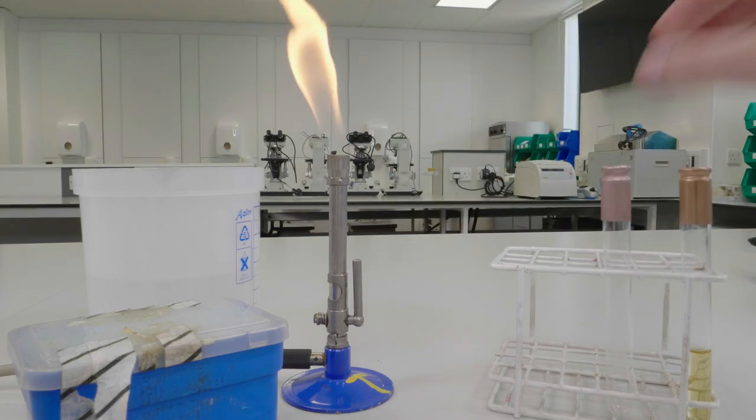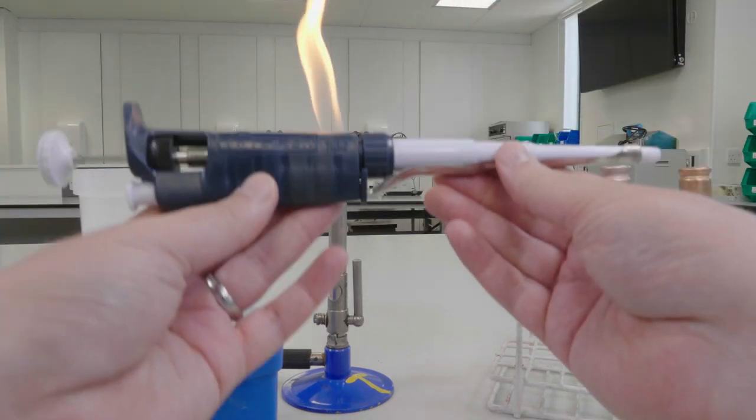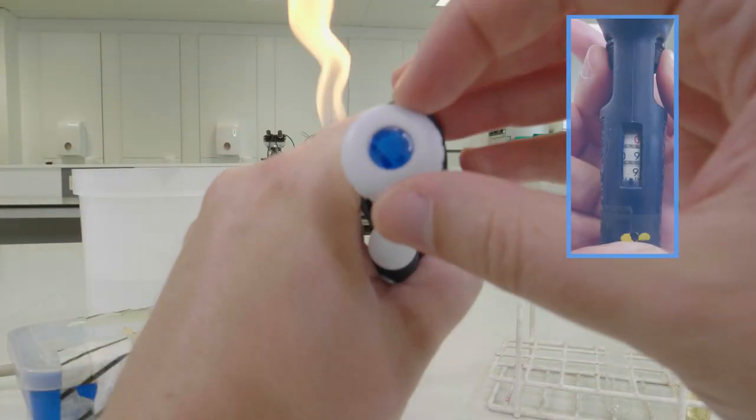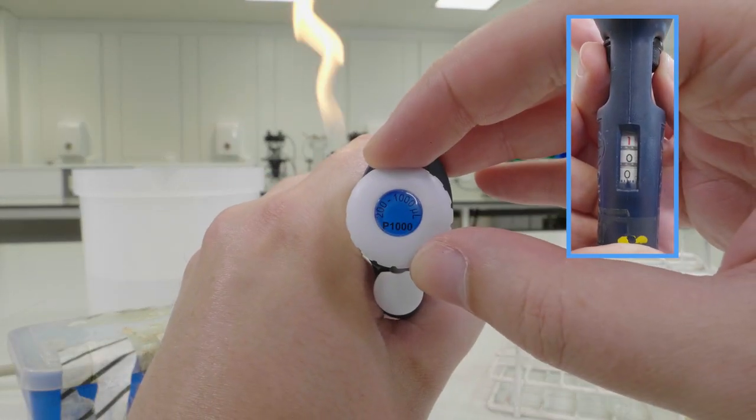For this method you will need a P1000 pipette which can be found at the end of the bench. You should set this to dispense 1000 microlitres.